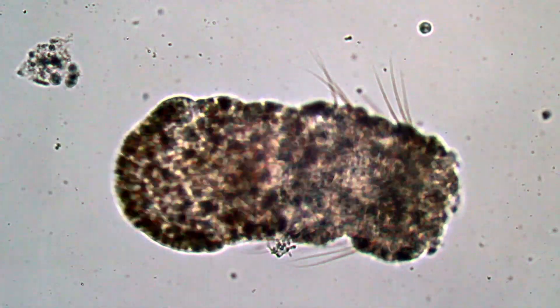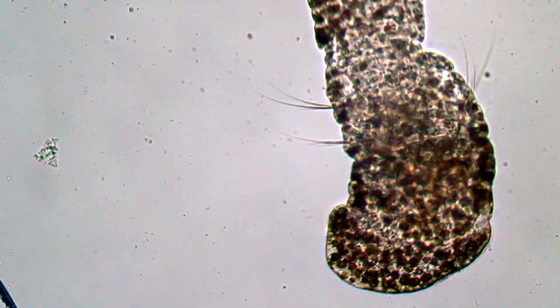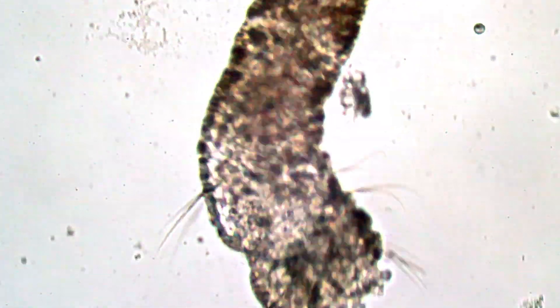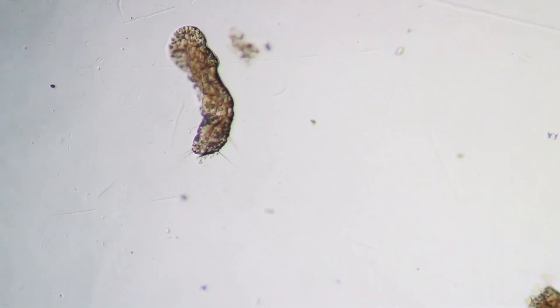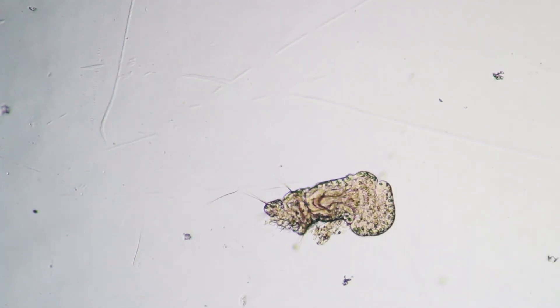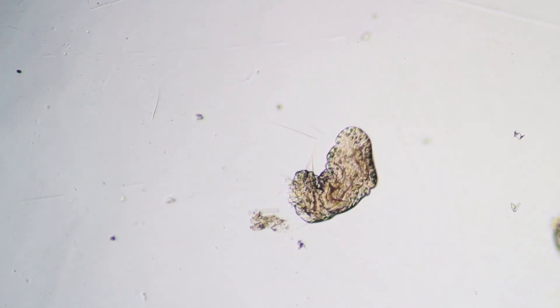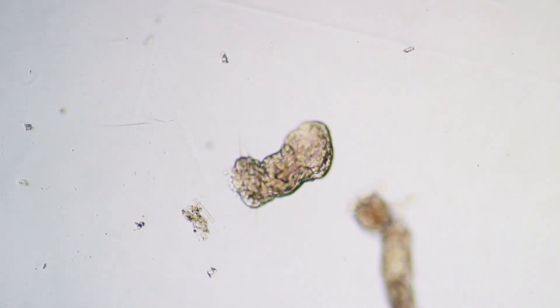It probably doesn't even know that the body is missing. I zoomed in a little bit more with my 10x magnifying objective — it's actually a little bit difficult to follow because it's still moving around so quickly. You can see the hair on the side of the worm and it's still moving around. It was quite remarkable to see that it did not change its behavior at all — moving around, searching for food as always, turning around and looking for some algae to eat.